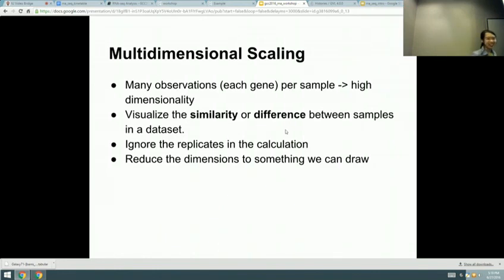Okay, MDS scaling. This is just a mathematical technique to visualize high-dimensional data. It just simplifies things into 2 dimensions. It's quite similar to PCA plots, which you've already seen from the DESeq2 output. So similar things should cluster together on MDS plots or PCA plots. Hopefully you see your 3 replicates clustering together.